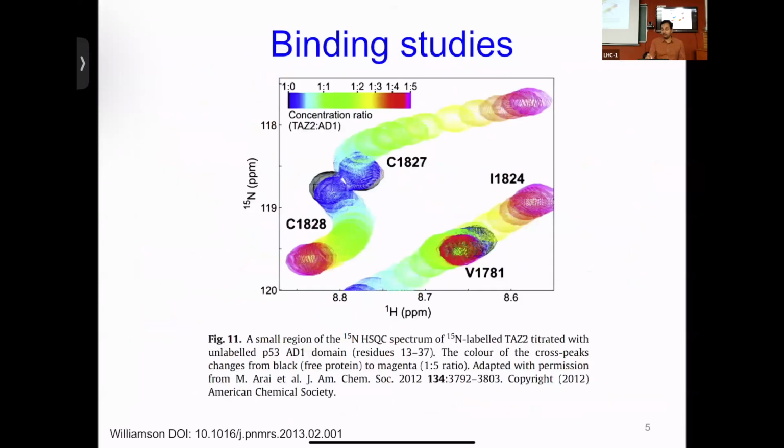This is an example where it's a very, very large protein. I forget even the size of the protein. Okay, P53, a certain domain of P53 is taken, and probably they're taking a short part of it. I forget the paper right now, but I've given the references, which you guys can go and see.